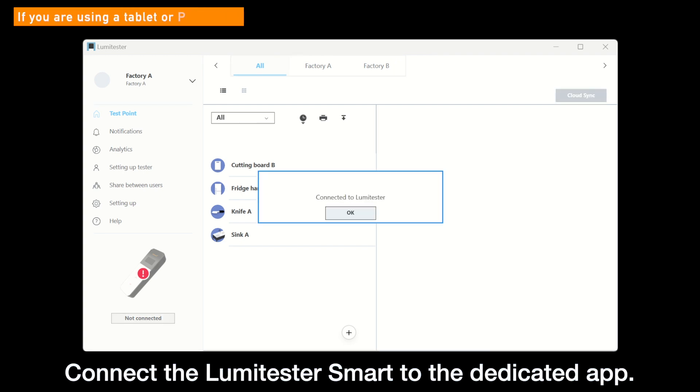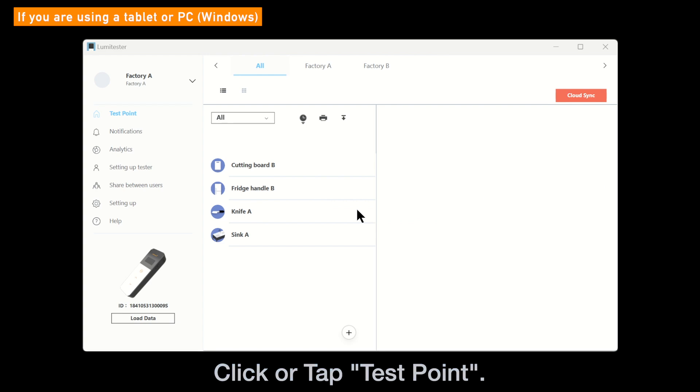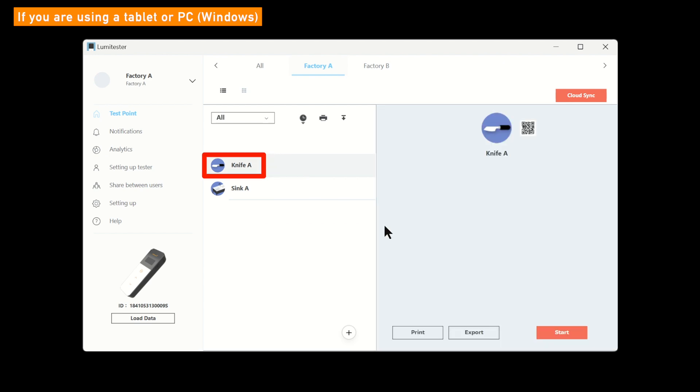First, connect the Lumetester smart to the app. Click or tap Test Point on the app. This time, we select test point group Factory A. Next, please select a test point. This time we selected Knife A.